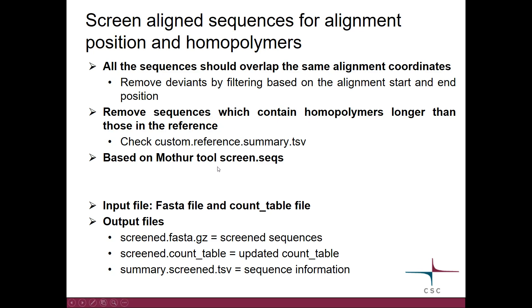You can check the longest homopolymer in the reference summary file. This tool is based on the Mothur tool ScreenSeqs — it's actually the same tool used earlier for screening the unaligned sequences. As you are doing this, the count table will be updated, so it's important to give it as input as well.